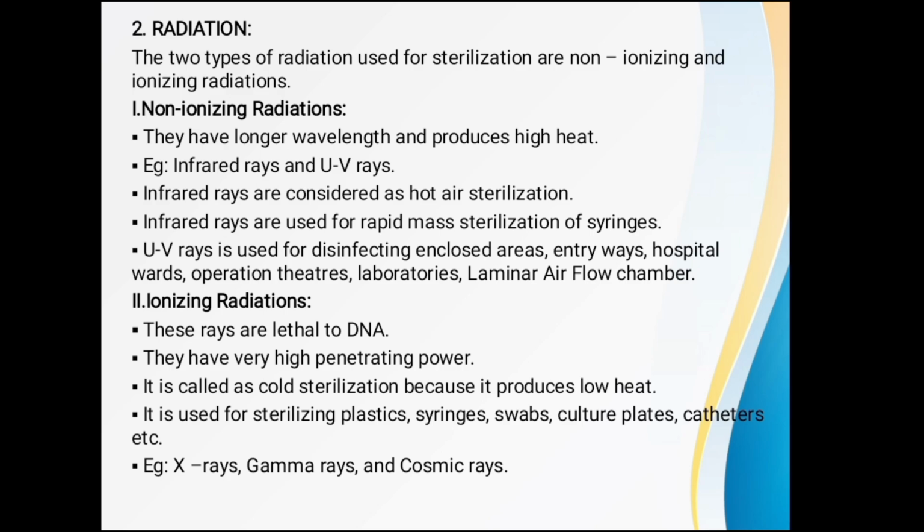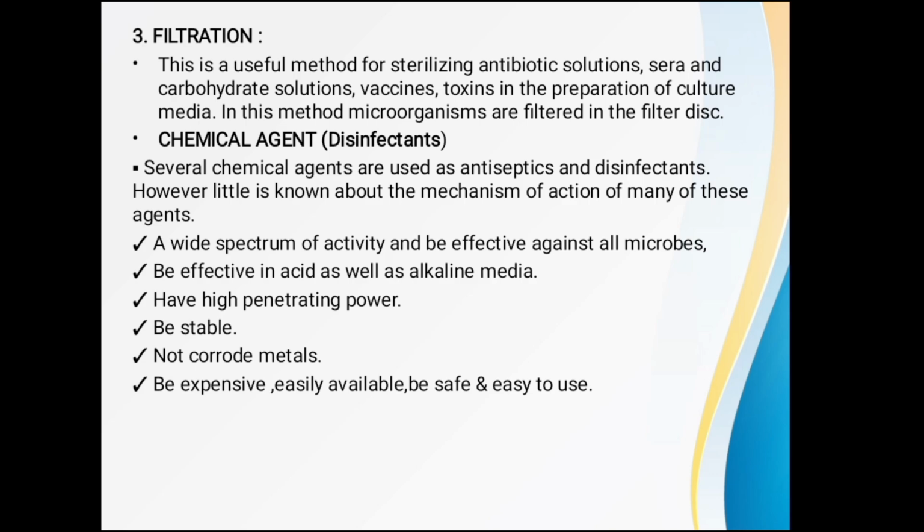Ionizing radiations, these rays are lethal to DNA. They have very high penetrating power. It is used as cold sterilization because it produces low heat. It is used for sterilizing plastics and syringes, swabs, culture plates, catheters, etc. Examples of ionizing radiation: X-rays, gamma rays, and cosmic rays. Filtration. This is a useful method for sterilizing antibiotic solutions, sera, and carbohydrate solutions, vaccine toxins in the preparation of culture media. In this method, microorganisms are filtered in the filter disc.